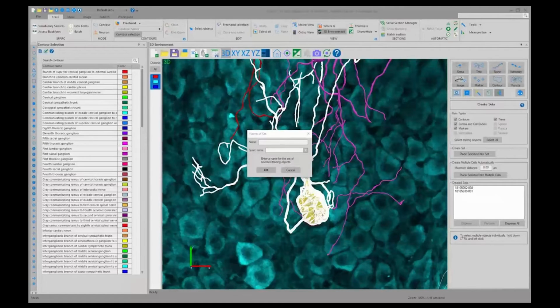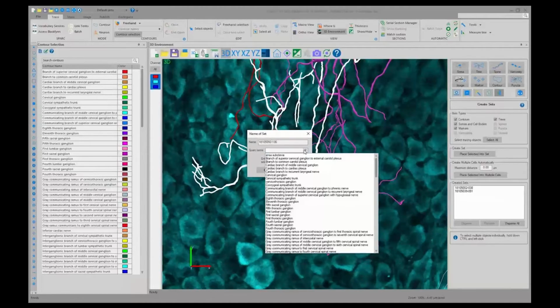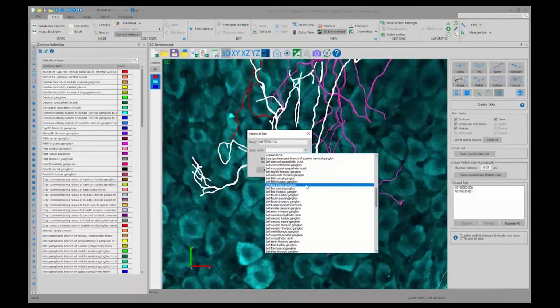Now, the Dr. Tompkins lab actually named these cells using a custom name. They put in the electrophysiology IDs to link these cells to their respective electrophysiology data. But you could name cells like these with their cell type, pulling the name from the SciCrunch terminology list.